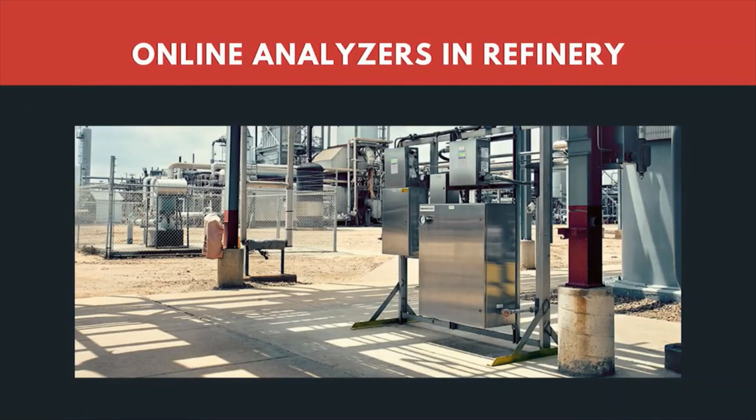Apart from the laboratory analysis, there are online analyzers inside the refinery. Why at all do we need online analysis inside a refinery? When you send a sample to a laboratory and wait for the results, it is going to take time. There will be huge latency to know the results of a particular stream. By that time, the refinery would have produced off-spec material, or material that does not meet specification.